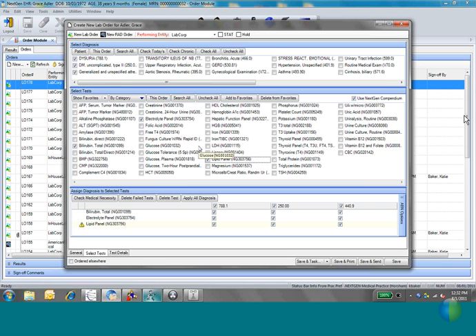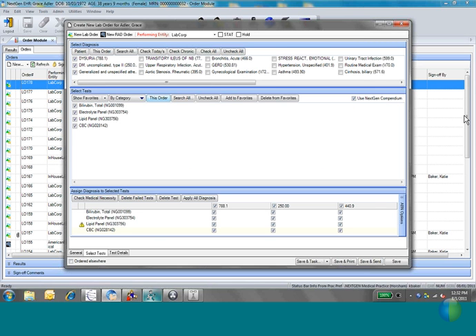Oh, I guess I don't have it on my favorites. Okay, oh, there it is. So either way, I've placed all of my tests here. And I have some other options. Again, you can filter it out to see what you've done for this order.